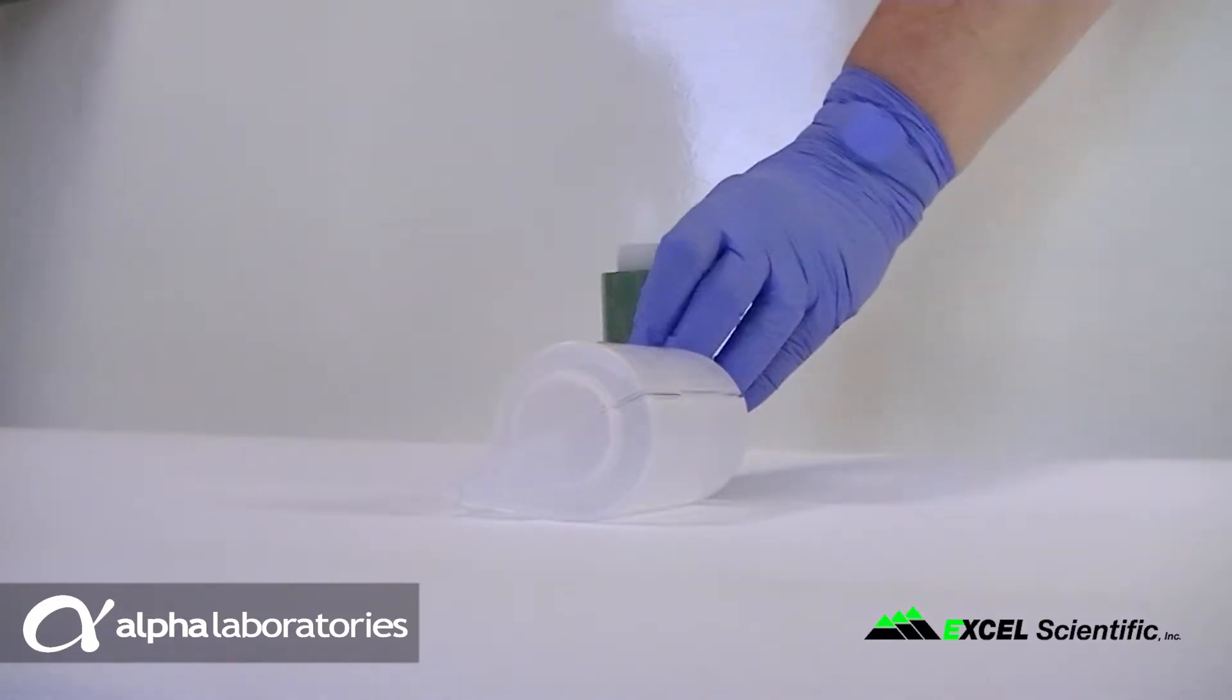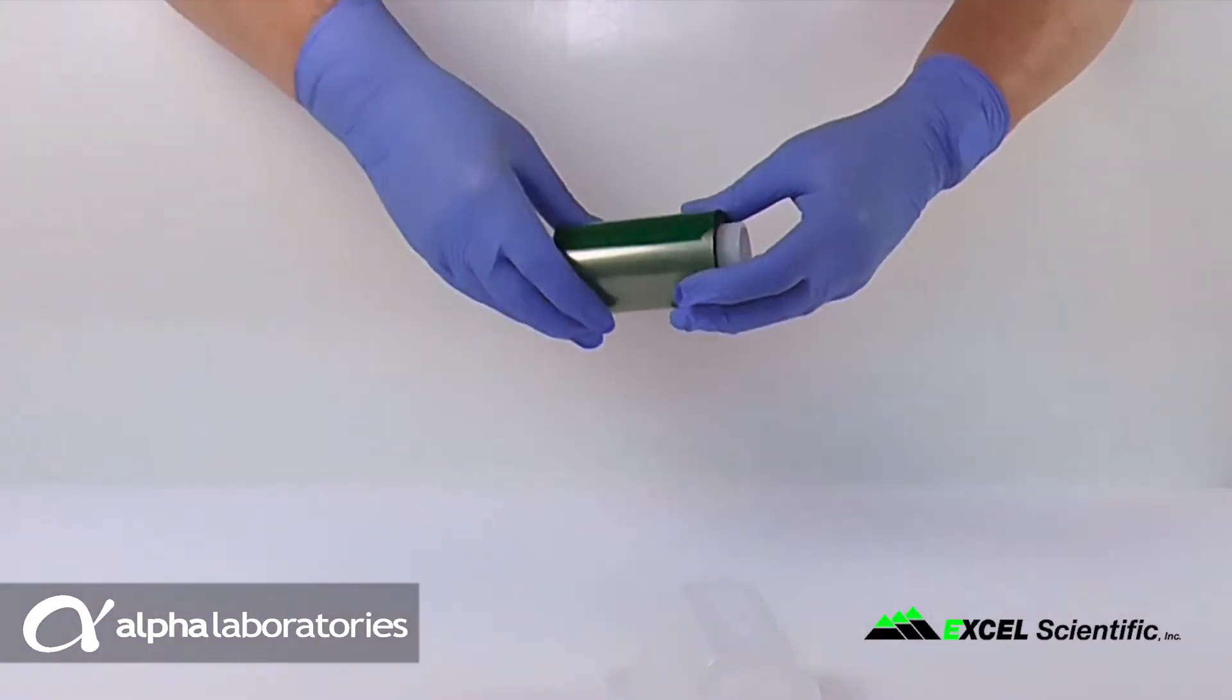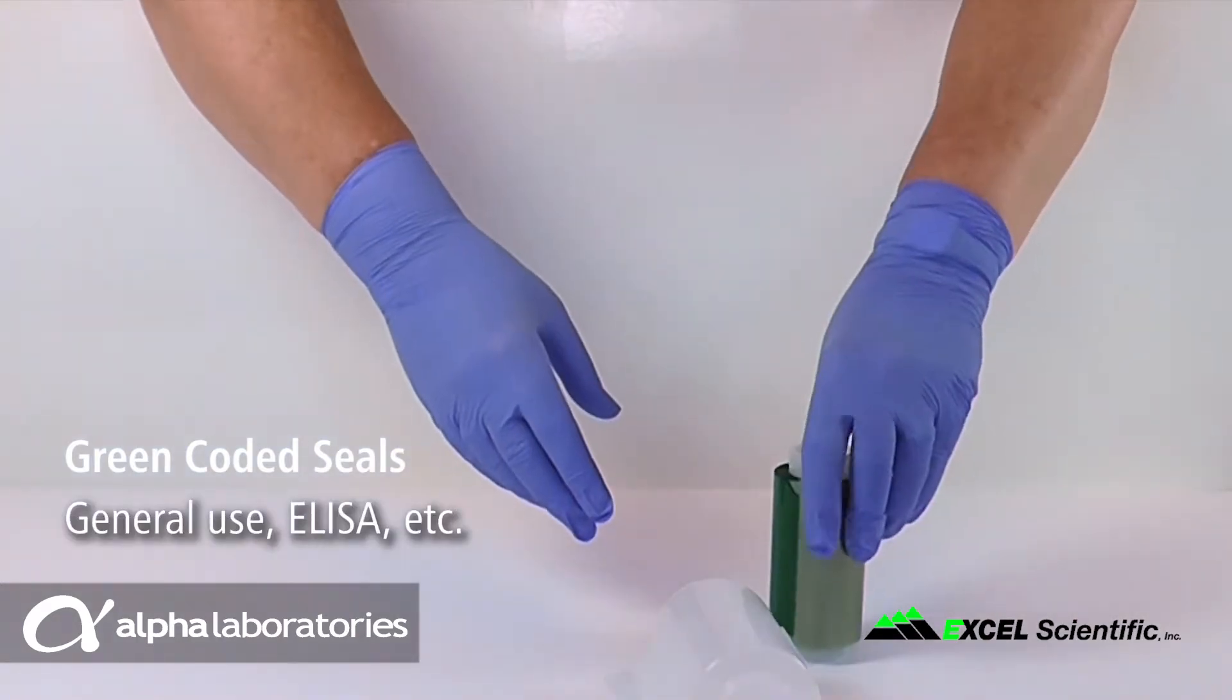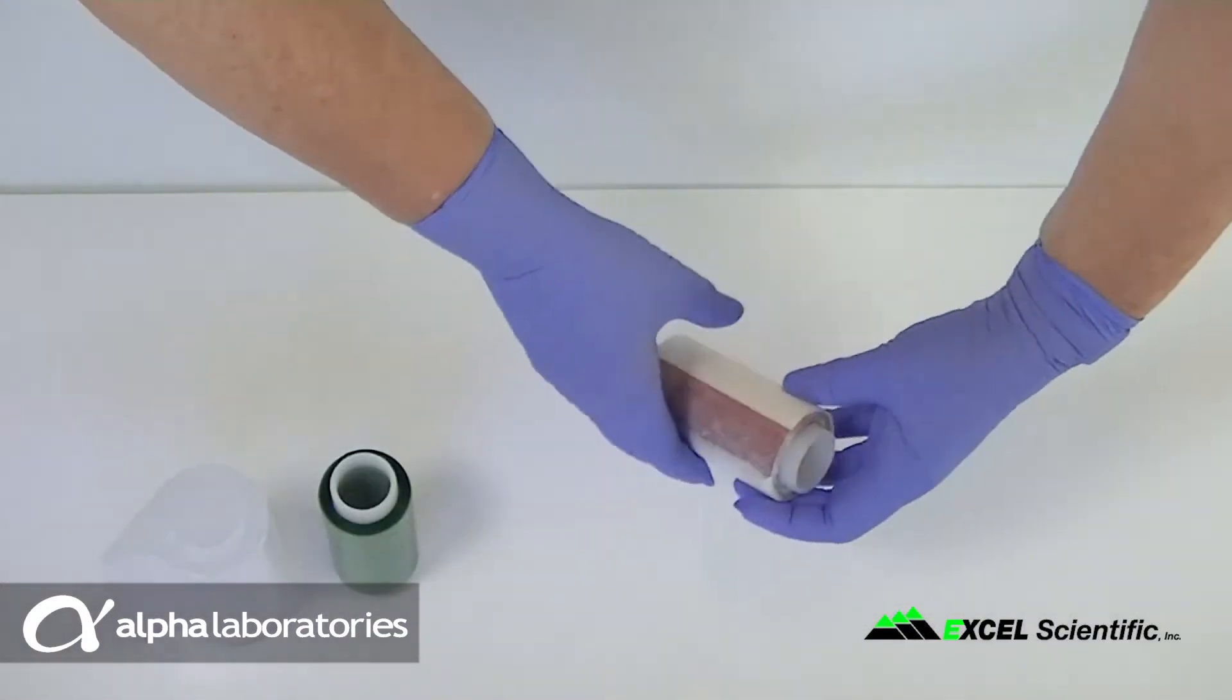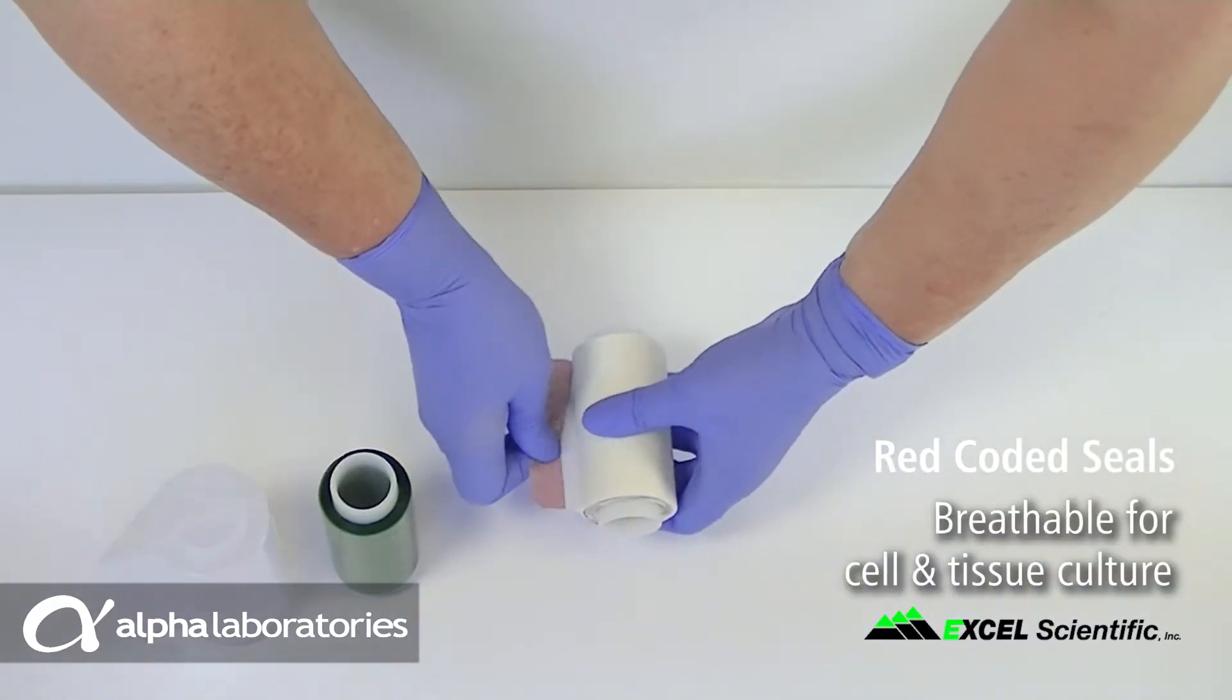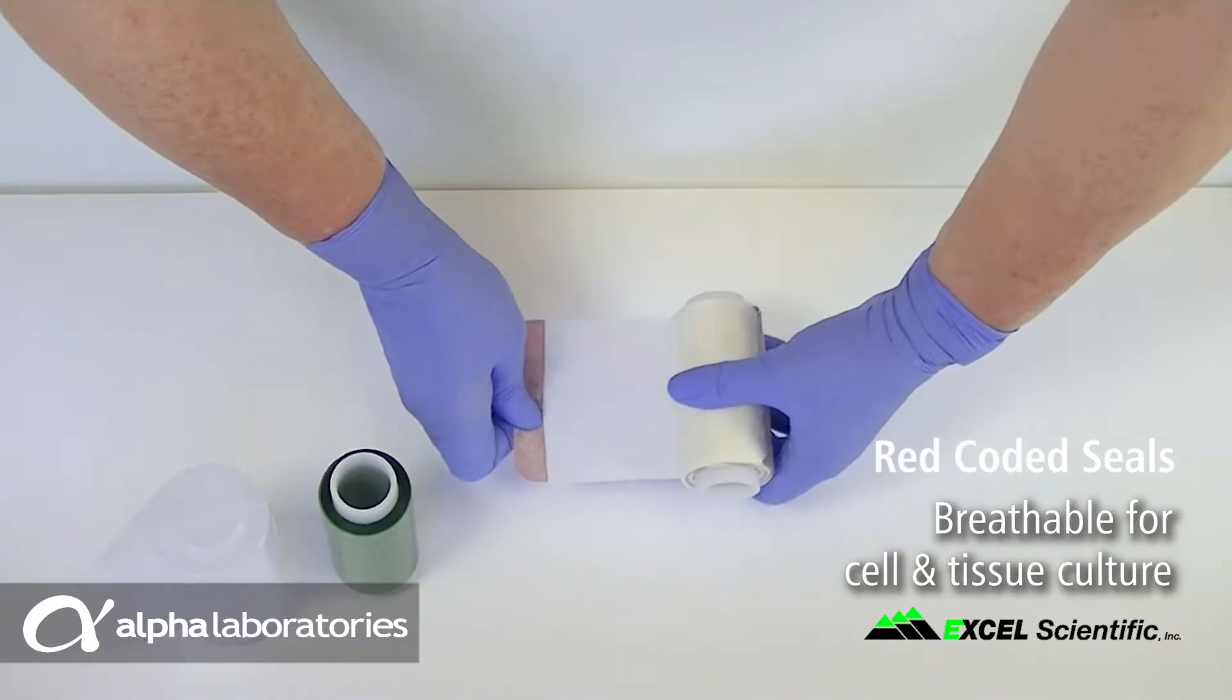Two types of sealing film are available in this format. The green color coded films are for ELISA and general incubation applications. The red color coded films are a breathable film allowing gaseous exchange for cell and tissue culture applications.